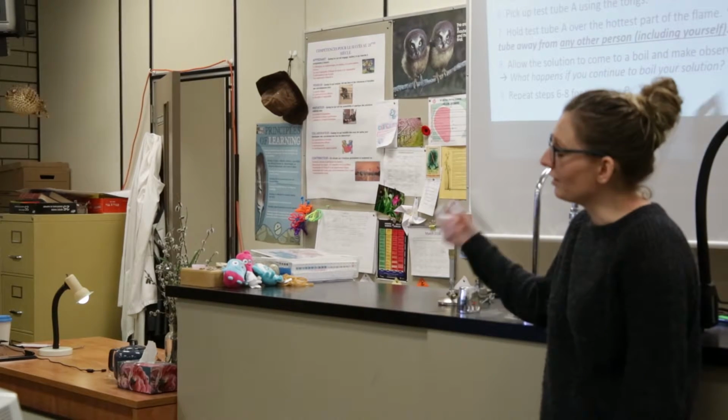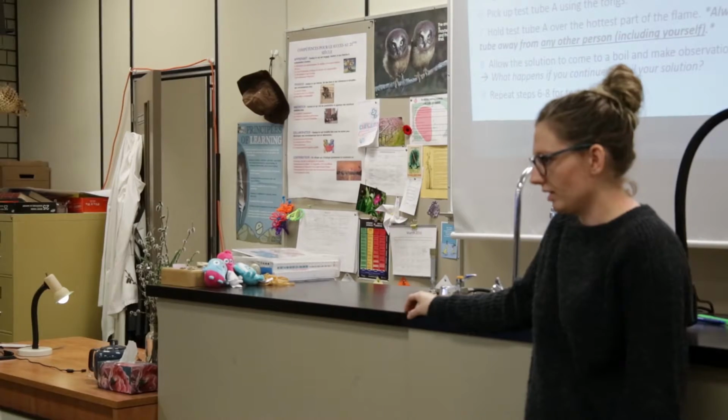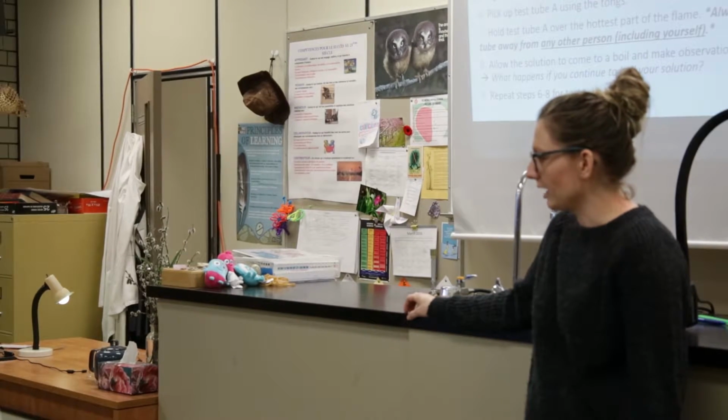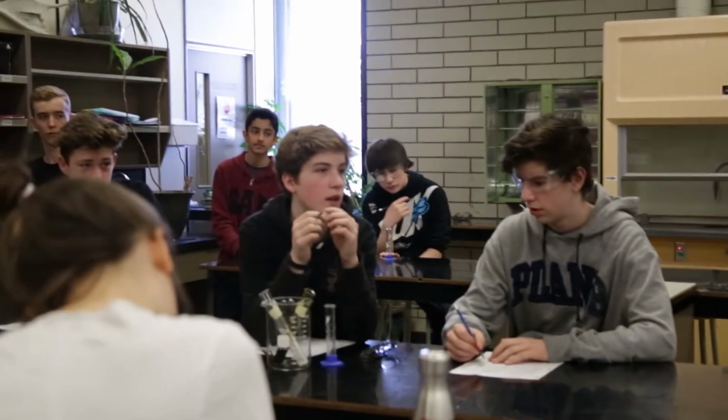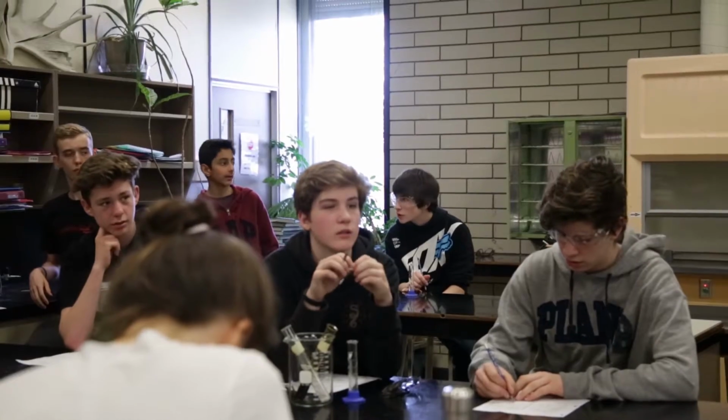Okay, so with that thought in mind, what if we added water to test tube A right now? Now that you have the water evaporated out, what do you think would happen? It would go back to salt water? Yeah. And you'd be able to repeat the experiment? You think so? Yeah, because it's just the water that boils off. Okay, so if we have time, let's try it. Let's talk about test tube B now, though.